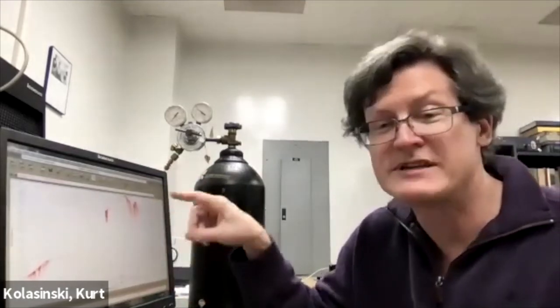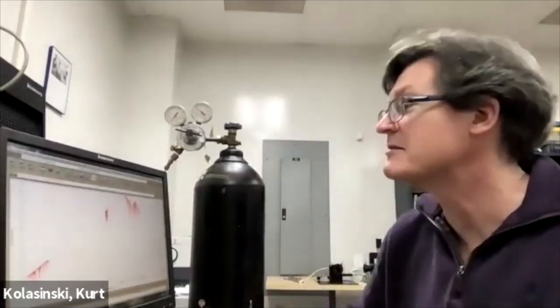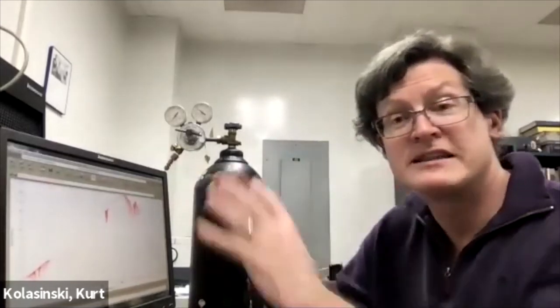They look like they have all these steps in them because you have to tell it to accept at least 3 decimal places. Excel, a lot of times it'll only give you 1 decimal place, and it just looks terrible. Excel is so brain dead, but I've mentioned that before. Okay, so I think we've got the data acquisition part, we've got the generation part. We'll talk about the data analysis part later.